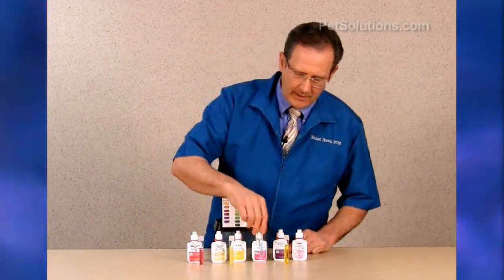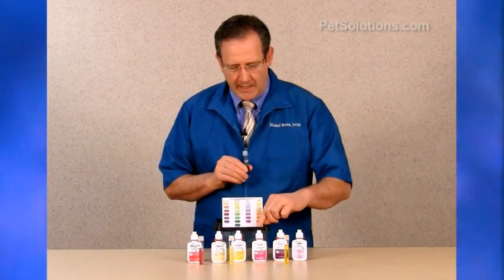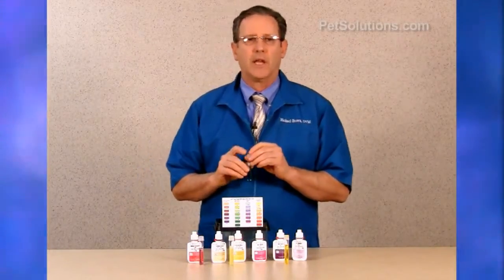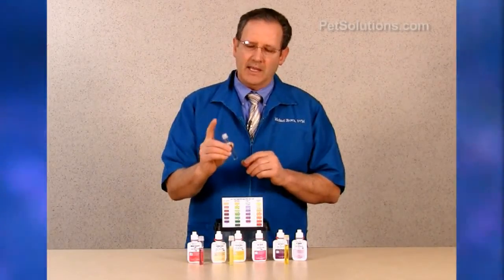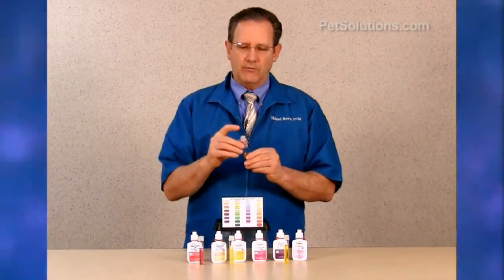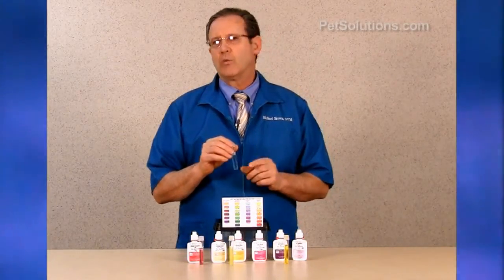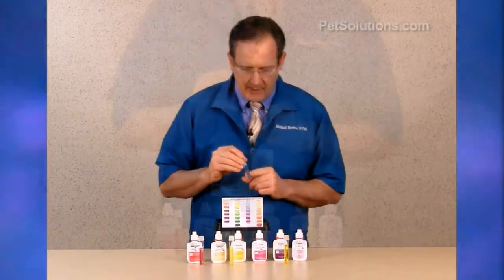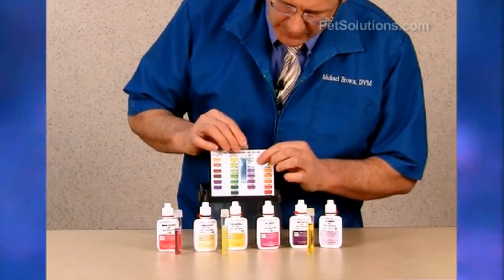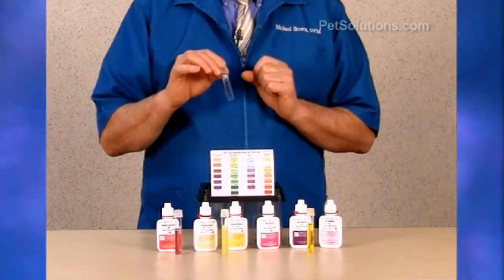To test for nitrite, clean the test tube and fill to the line, which is 5 mLs. Add 5 drops of the nitrite test solution, cap and shake for about 5 seconds. Do not use your finger over the end or this can affect the results. Wait about 5 minutes for the color to develop, then compare it on the chart. This one is about 0.25, which is in the low and acceptable level.